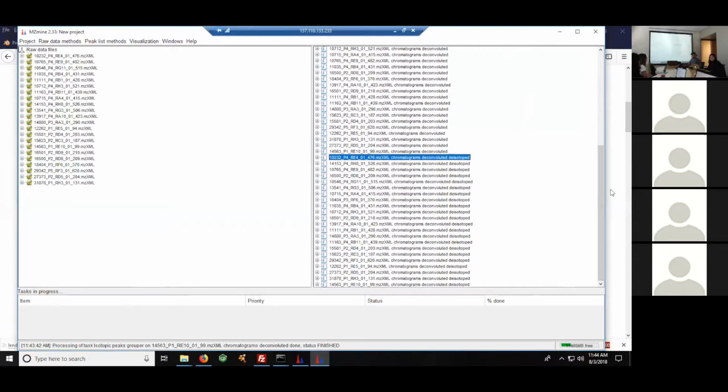What about when you do isotope enrichment studies? How would you deal with that kind of thing? Would you leave them in? So for example, if I would do a full labeled experiment with 13C sugar, then I would not expect to have that isotope pattern. So then I maybe could consider other isotopes like 15N to group them, but it's probably not as crucial as 13C because it's not as abundant, unless you have other weird heteroatoms such as halogens. So.